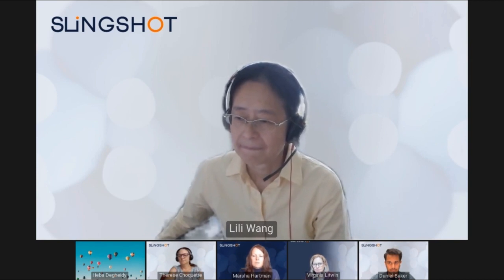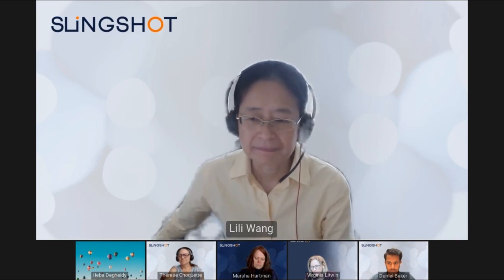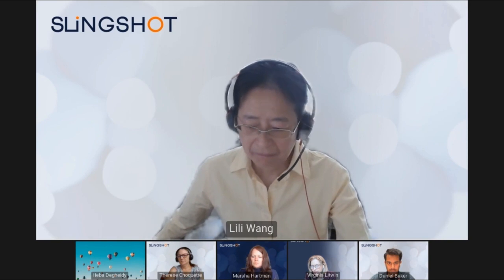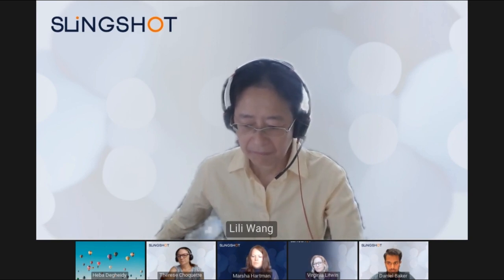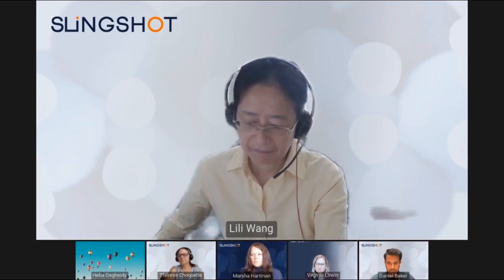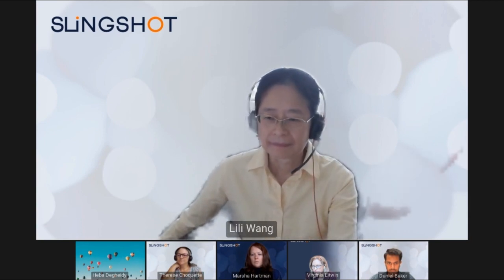So we have collaborative studies, as Lily mentioned, under the Flow Cytometry Consortium to develop biological reference reagents and reference standards for many assays. We also collaborate with many other institutes for reference reagents for different cell types. In general, controls are very essential and critical, and they should be introduced as early as possible when developing your assay, so you have tight control on your variables as well.